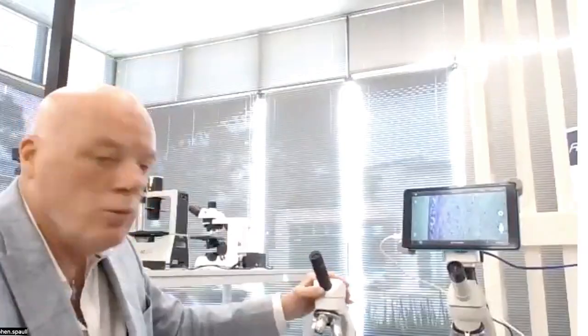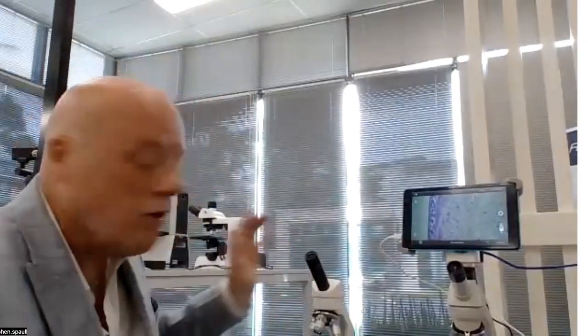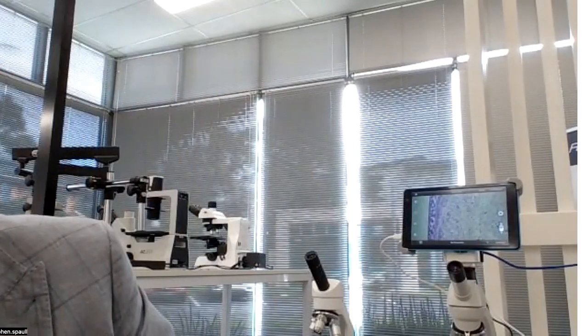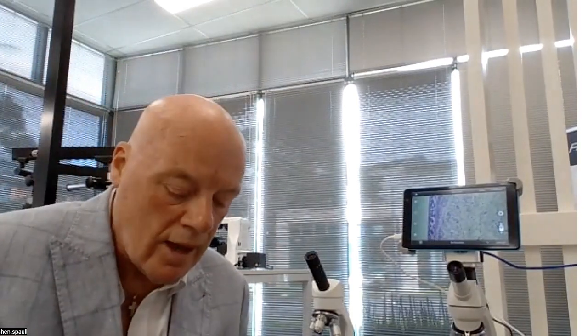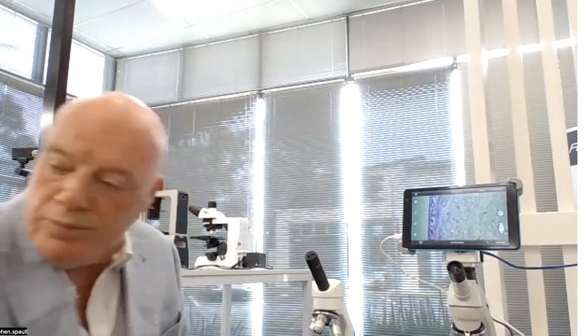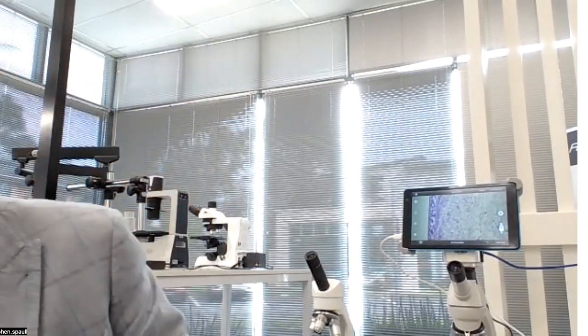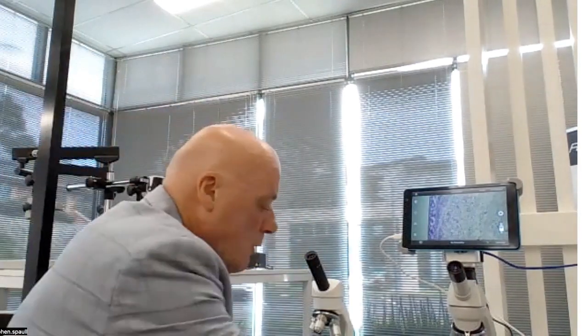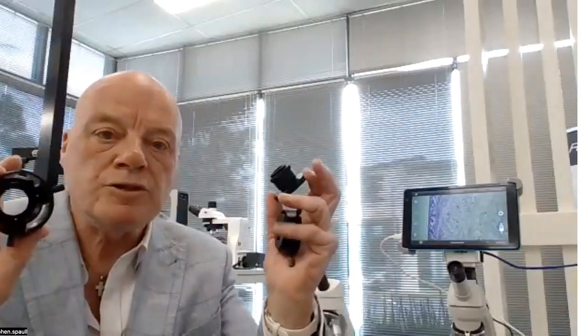For devices that don't have a port, and we're talking typically a monocular microscope, which we've got here, and it doesn't have a video port, the cameras come with a thing called a focusable lens and an adapter. So you've got 2 adapters. I'll just get the focusable lens for you. So this comes in the box. You've got a focusable lens and you have 2 eyepiece adapters.